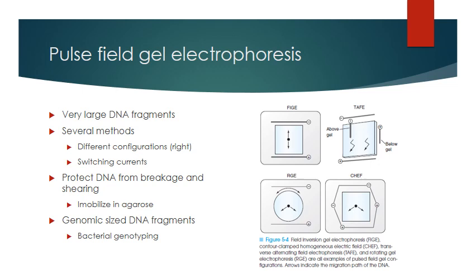So it'll probably have to be further treated with maybe a restriction enzyme, or you can even do that while it's still in the agarose plug. There's no restrictions against that. You can immerse the agarose into a restriction endonuclease. And then you can insert that plug directly into another gel for routine electrophoresis. You don't have to necessarily isolate it from the agarose or anything like that.